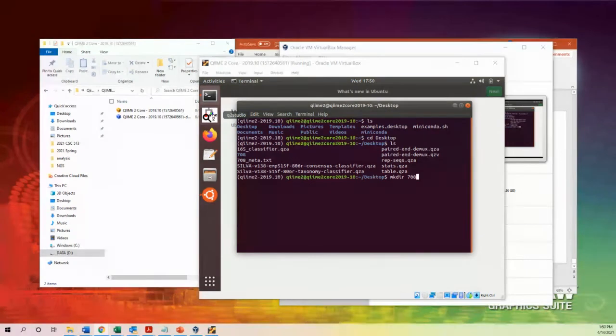Okay, once this is done, I already created 708, so I'm going to delete this. You use the backspace to delete it.